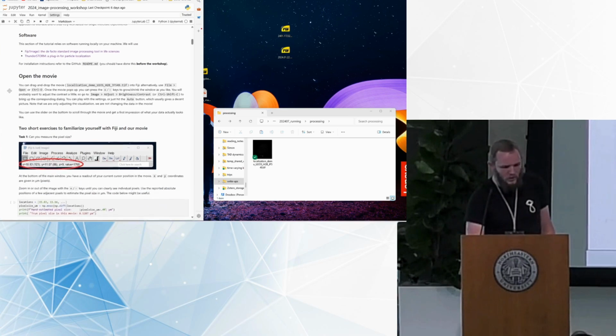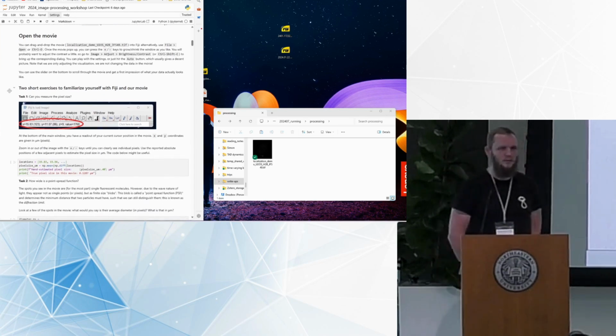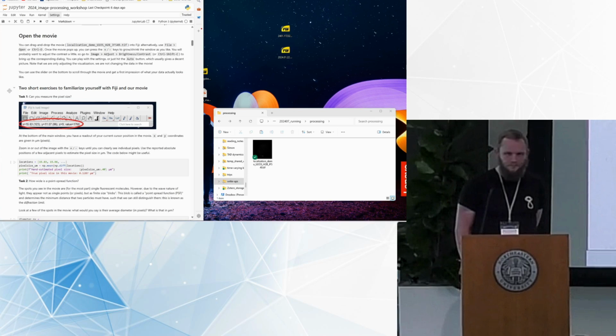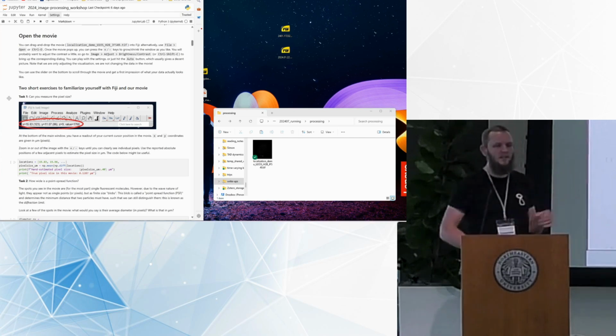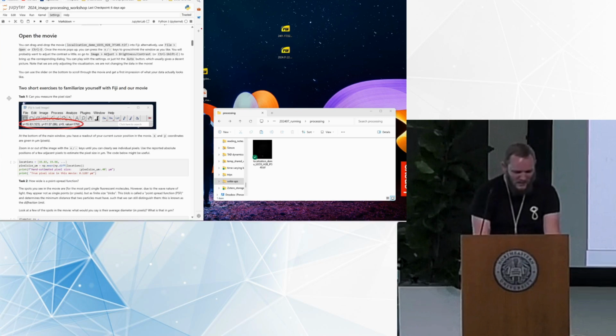I have a few example tasks here for you to play with a little bit and familiarize yourself with Fiji. So the idea is to get everyone a little bit up to speed and on the same level. Given that many of you have some experience with Fiji, we probably won't spend a lot of time on this. Also, if anyone has any questions on the content here and how to do things, always feel free to ask. I'm very happy to have a live discussion that makes it a bit more live.